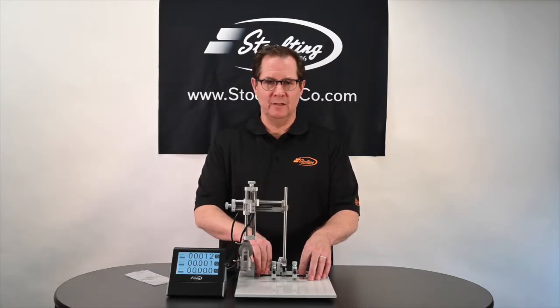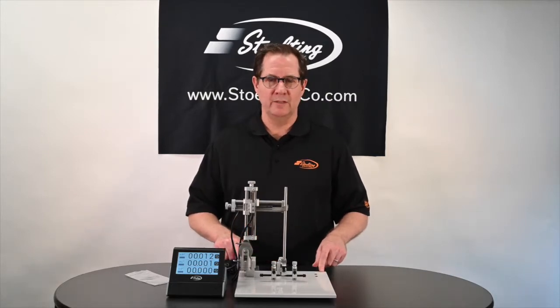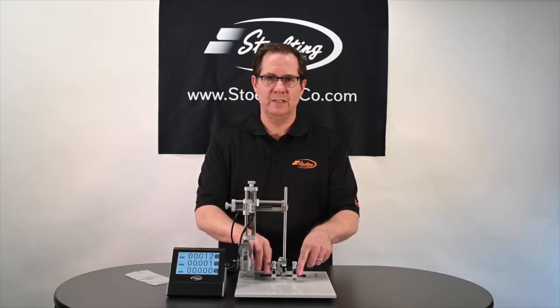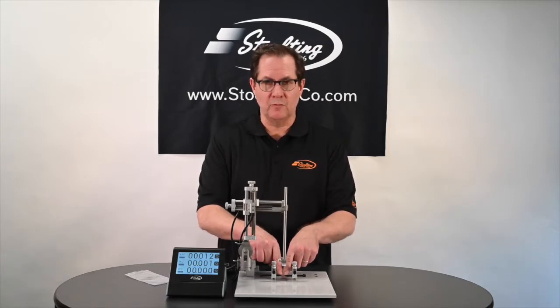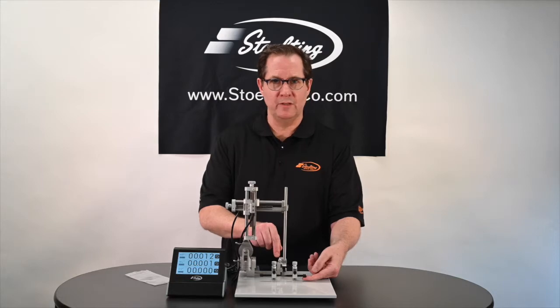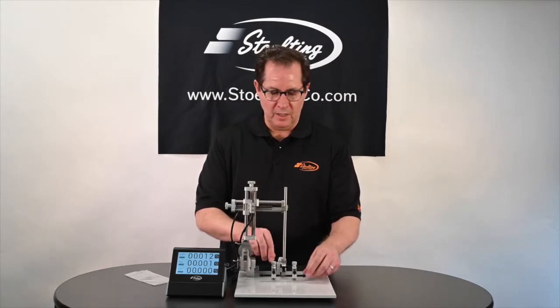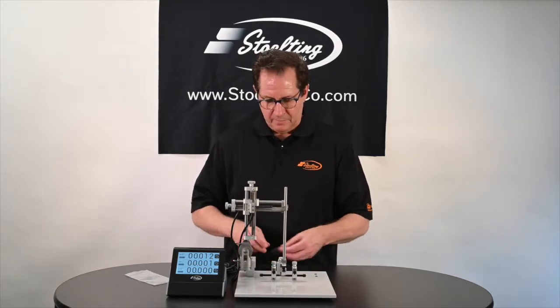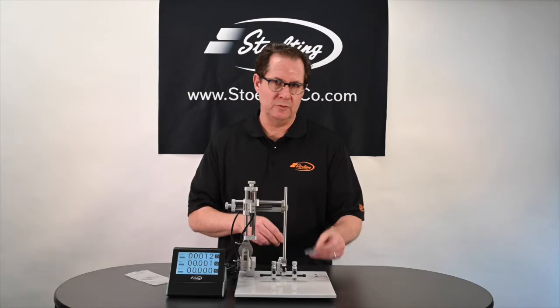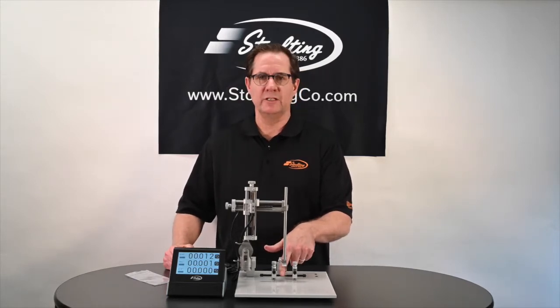The base of this particular model — the 51730 series, the just for mouse series — has a base plate that is 25 by 25 centimeters. It has three vertical posts. Two of these posts are holding the ear bars, and these ear bars each have different ways of holding the animal's head. You have the traditional way of inserting into the ear canal of the mouse, and then the other side is these rubber tips that are available for a different type of hold, or they're very good for neonatal mice or rats.